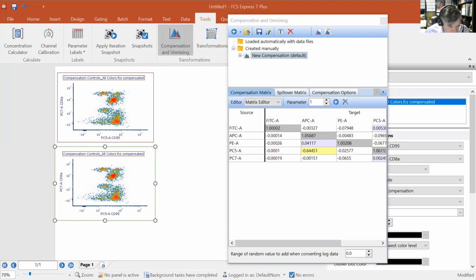So with that, I wanted to see if there are any questions or comments that folks have about compensation before we move on to the next topic, talking about some of the high dimensional data reduction tools. And just to relay a message that came into the chat window, just as a reminder, using those slider bars impacts data integrity, right?